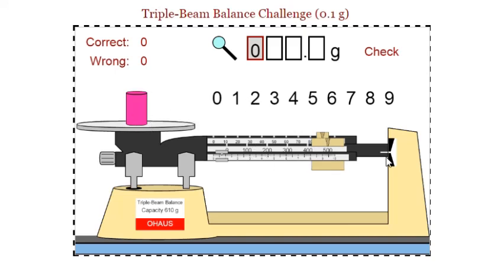You put a mass on here and it's kind of like a little seesaw. This side will eventually come to a balance point where the white lines are kind of matched up. That's when you know you're in balance. You've got some masses sitting here and they are equal - they're able to balance out this particular mass. So it's a way of finding out the mass.